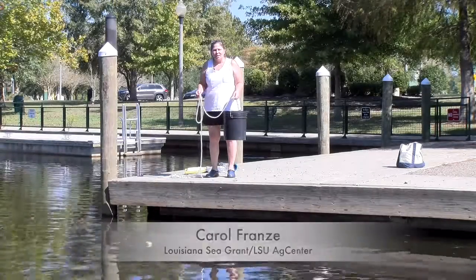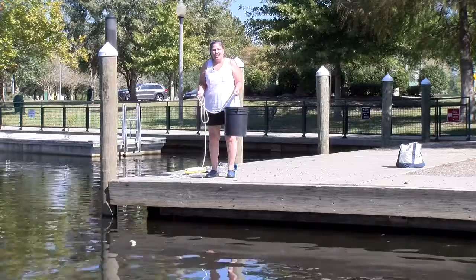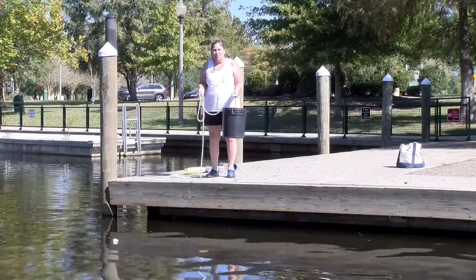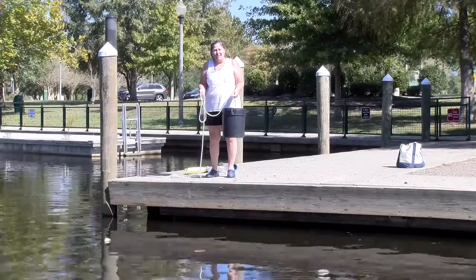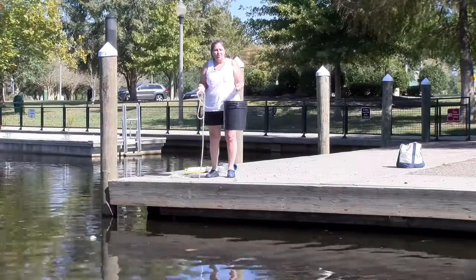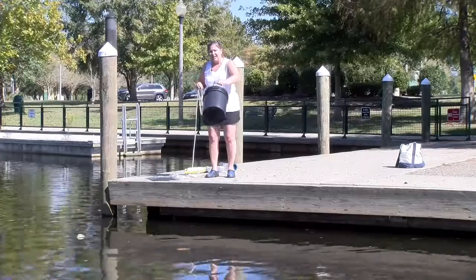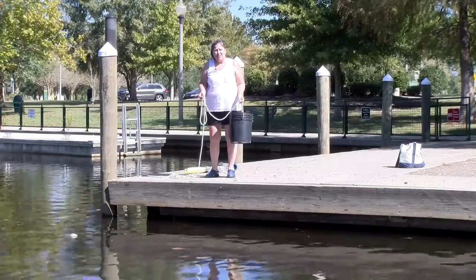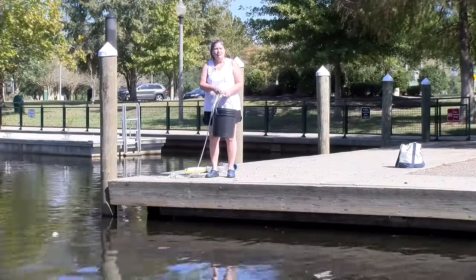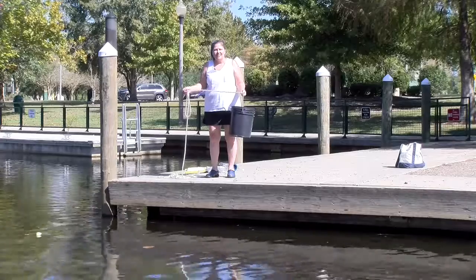So today we're at Bayou Bonfouca in Slidell taking water samples. The first thing students or scientists do when they want to learn about the health of a water body is they take water samples. A surface sample is taken with a bucket with a rope on it so that you can throw it out into the water to take your water sample. When you're taking a water sample, you're only going to take the water that you need, the amount of water that you think you'll need to conduct all of your tests.